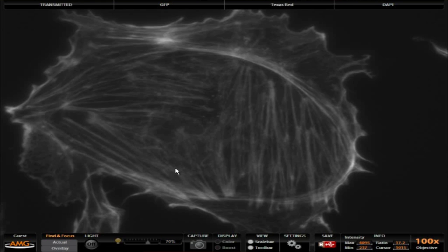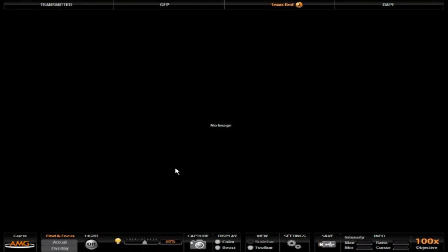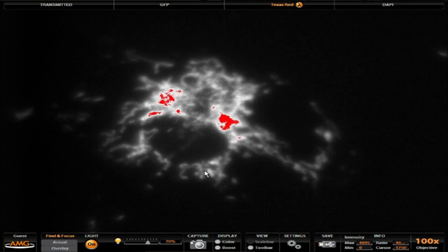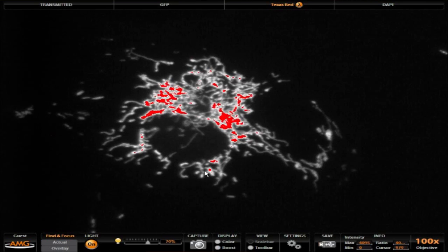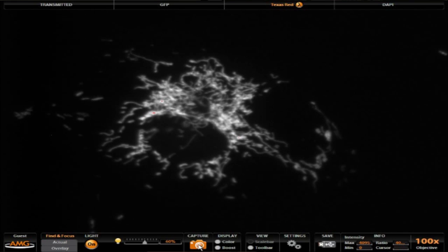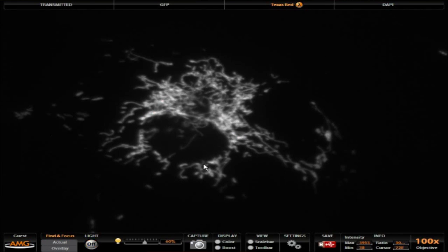Now I'm going to switch over to the Texas Red channel, and that's going to show us what's going on with the mitochondria. Turn on the light and bring this up. Maybe adjust my focal plane a little bit here to optimize it. There we go. That looks good. I'm a little saturated, so I'm going to bring this down. Click on capture. Get a nice image.